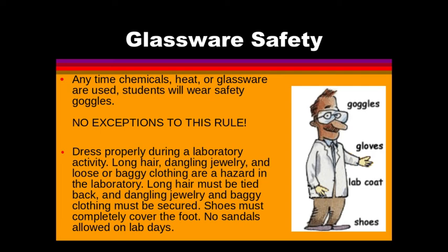A typical rule is that long hair is pulled back, and no dangling jewelry or baggy clothes, all those things that might entangle or are things that we don't want to deal with. So, like if we are working with chemicals and you have sandals on and it spills, well, now it's all over your feet. And now we have to rinse off your feet in a sink, and it's just not a good thing. So, having closed-toe shoes. If a beaker breaks on the floor and you have sandals on, then we're probably going to send you to the nurse so the nurse can make sure there's no glass in your toes.